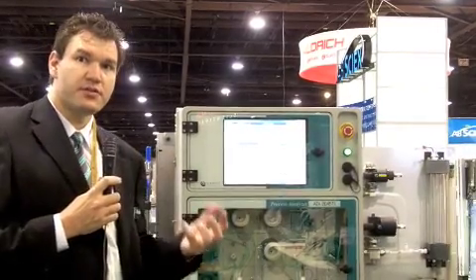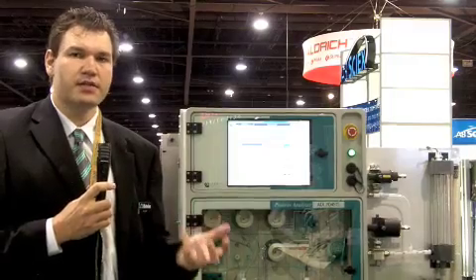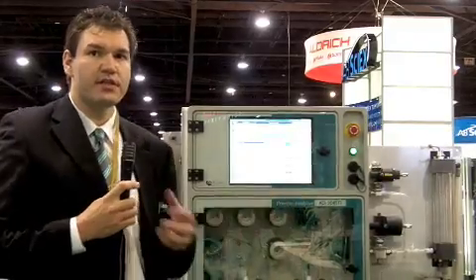In the process, we have different users and different requirements from the process side. We made sure that during the development of these analyzers, we adapted the system to the requirements of the process and its users. Combining different parameters in a single system is really the best approach.